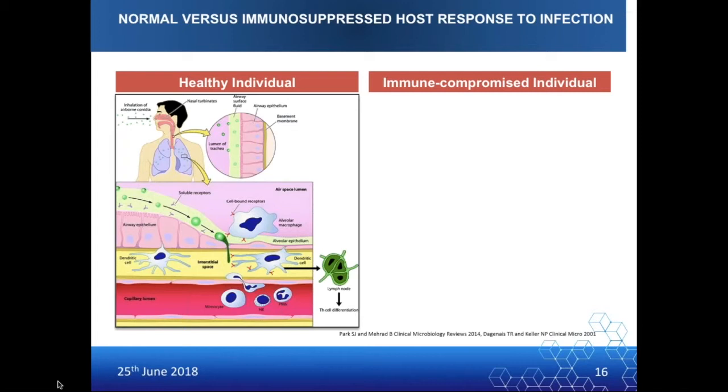And when we inhale them, and when we are healthy, the conidia are first trapped within the mucous layer of the lung or respiratory epithelia. But whenever the conidia are able to break through the borders of those epithelia, the immune cells are immediately activated and react to incoming pathogens.